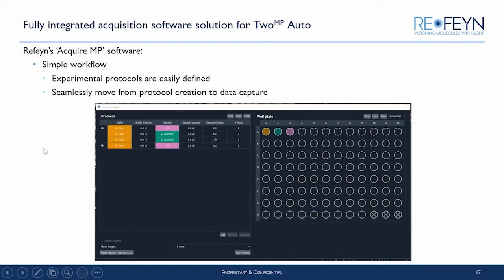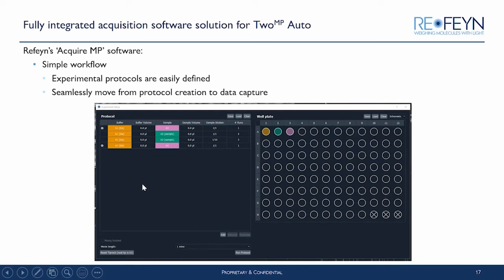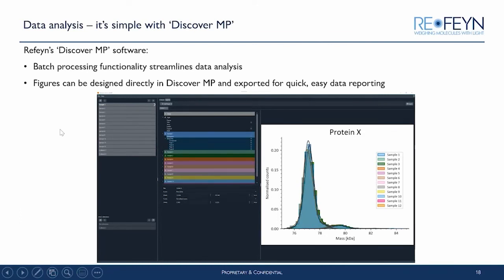It is not just a hardware solution — there is a fully integrated software solution working within our acquisition software called AcquireMP. Experimental protocols can be easily defined, and once those protocols are created, moving from protocol creation to data capture is seamless. You can populate the well plate view with your samples and define the protocol — specifying what volumes will be dispensed into the sample wells of the gasket loaded onto the mass photometer. Each dataset captured during an acquisition run can be loaded into DiscoverMP software as a batch, which is then analyzed automatically. Figures can be designed directly in DiscoverMP and exported for quick and easy data reporting.